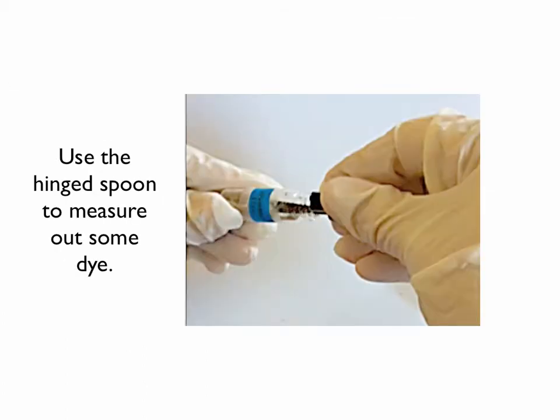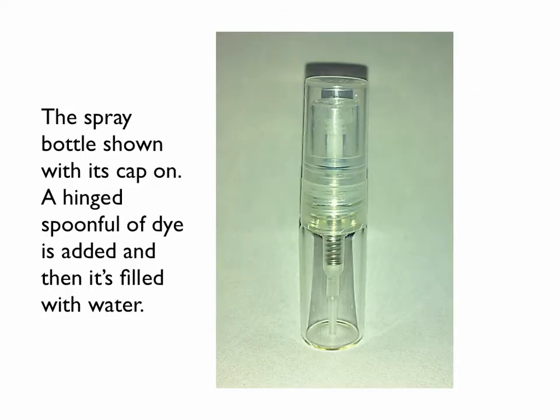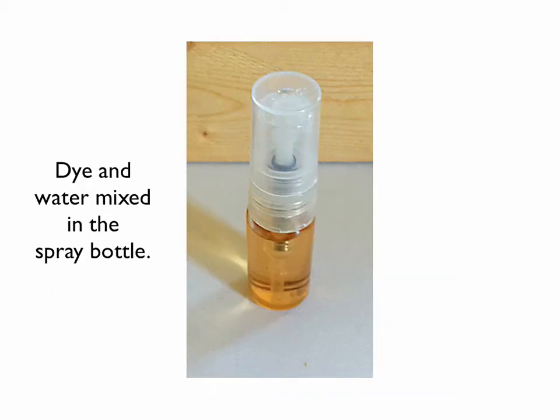The powder is mixed with water, so we use a spray bottle. Here's the spray bottle. Put 1 spoonful of dye powder into the bottle and then fill it with clean water. Put the cap on and shake to dissolve the dye. When the dye is mixed with water, the color will be orange.